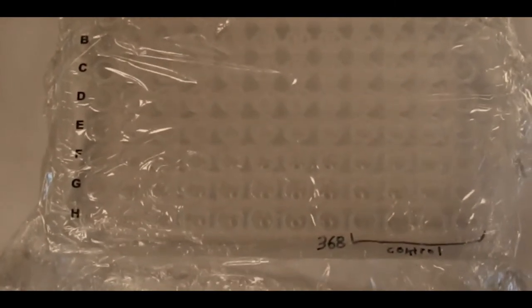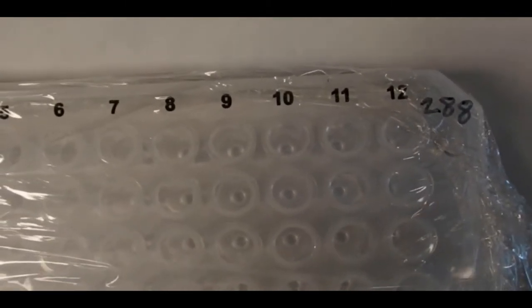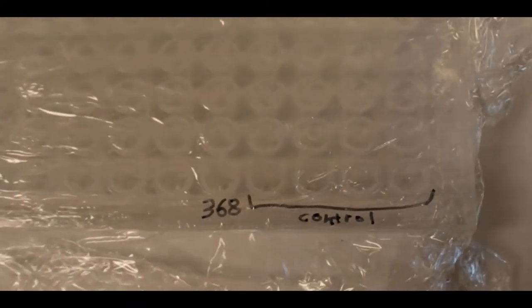And you'll also be given a plate with solution in it that will be sealed with plastic wrap, and you can see, if we don't have too much glare, that the first well is 277. The well on the right is 288, and then your final well here will be 368. The last four wells will be reserved for a control. Anyway, Sarah is going to show you now how we're going to do this punching procedure.